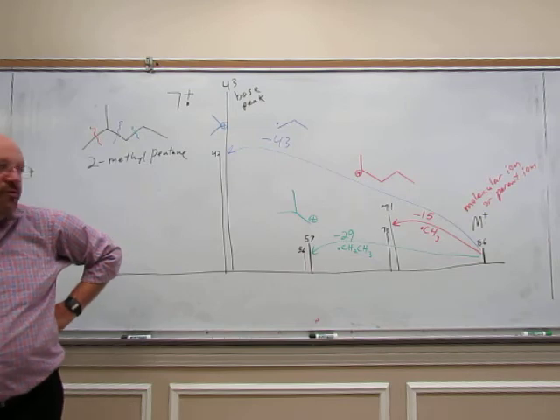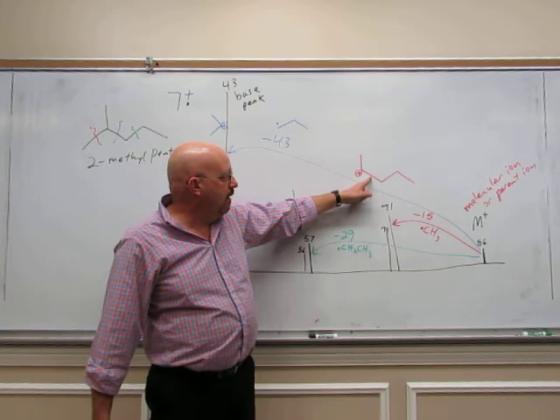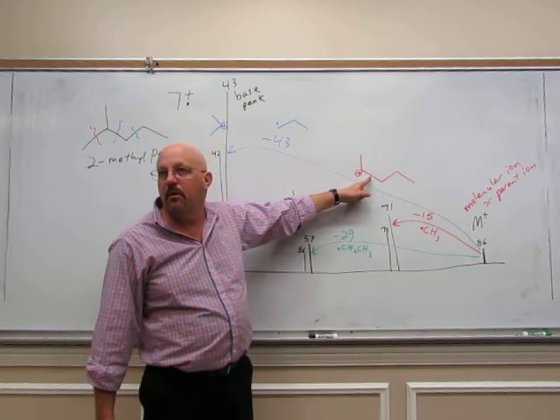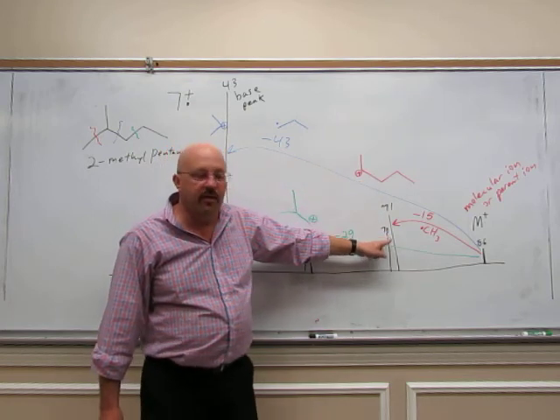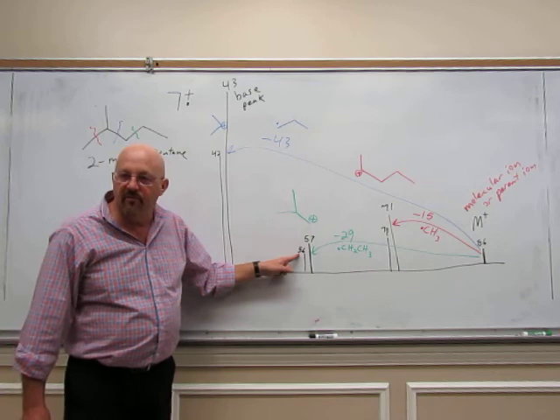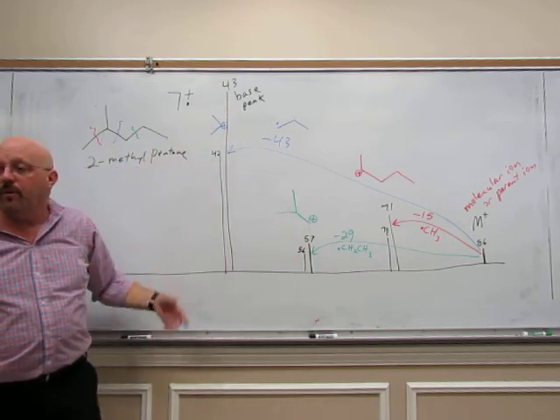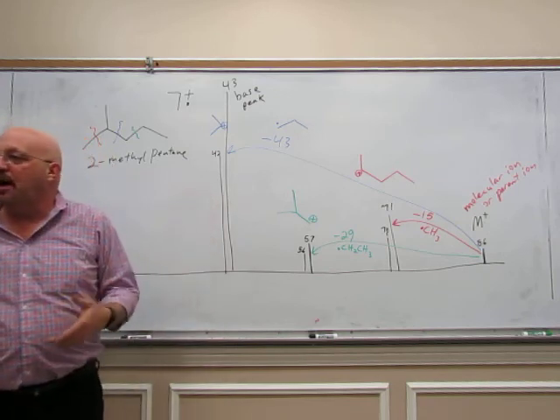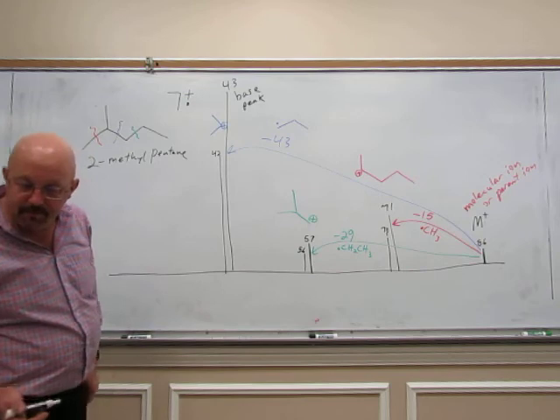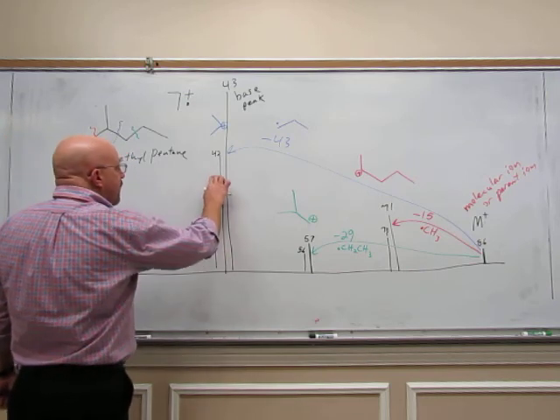Hydrogen. This is where the 71 peak lost a hydrogen somewhere. It lost a proton. So it lost a hydrogen somewhere, now it weighs 70. This one lost a hydrogen, now it weighs 56. This 43 lost a hydrogen, now it weighs 42. So when you see these peaks on the side, this is where it's losing hydrogen. You may even have another one. Like that 43's got a 42, it's also got a 41 here on the side.